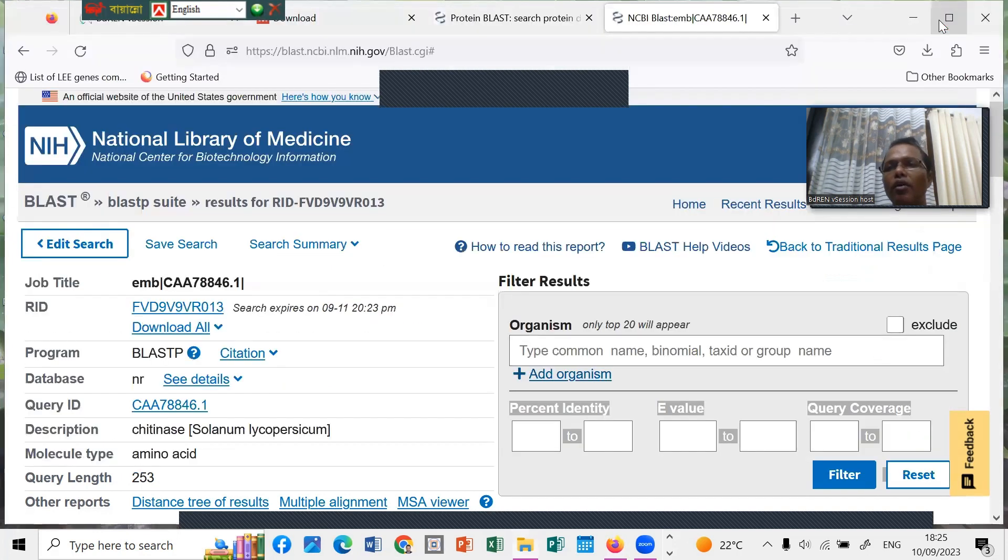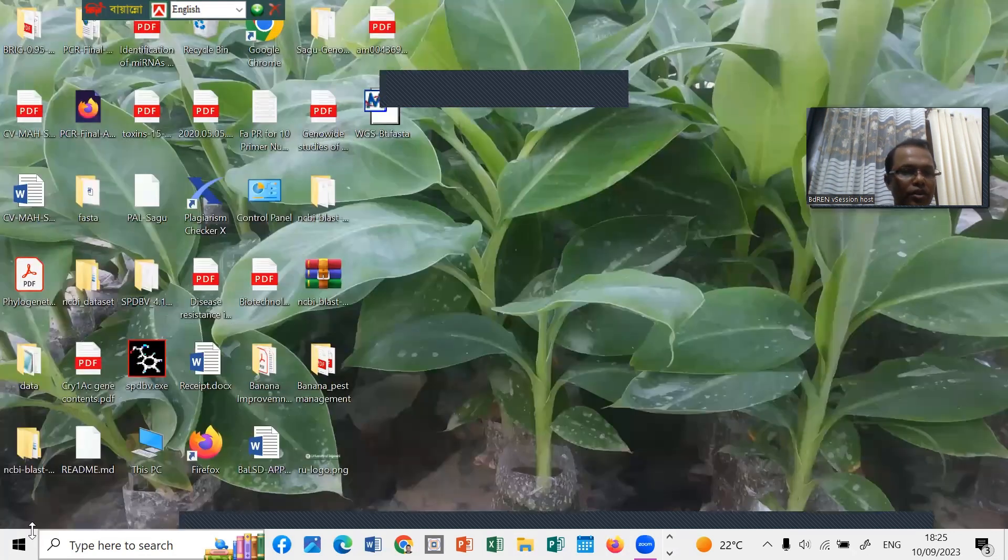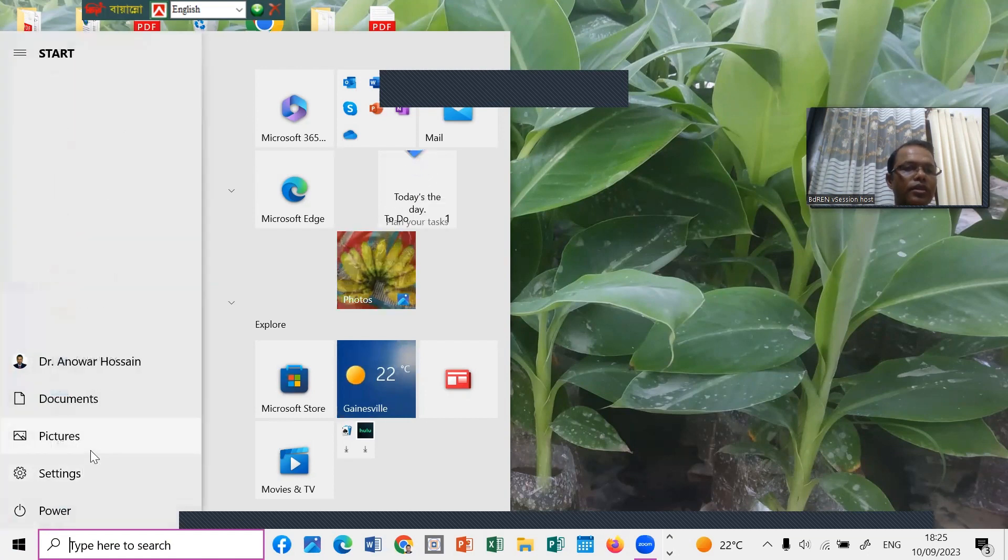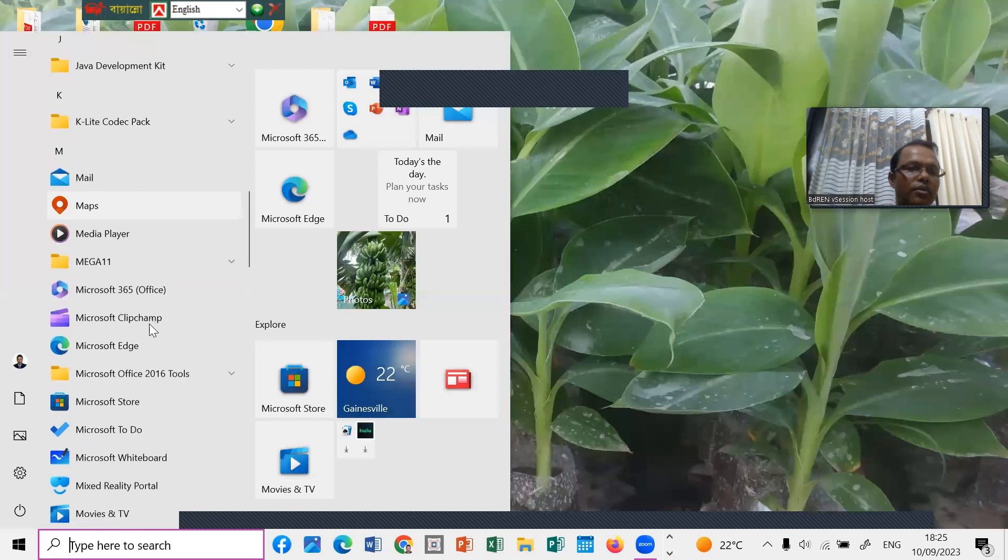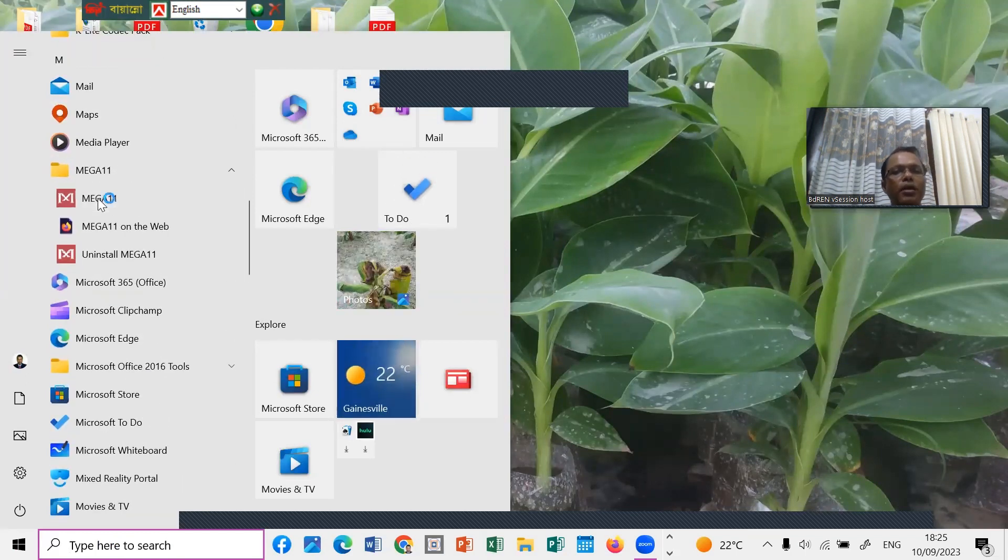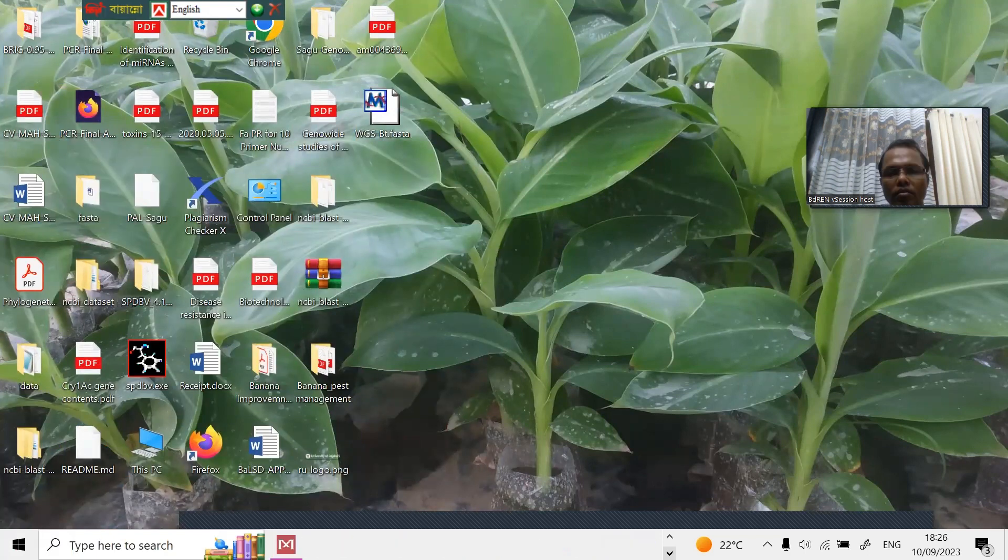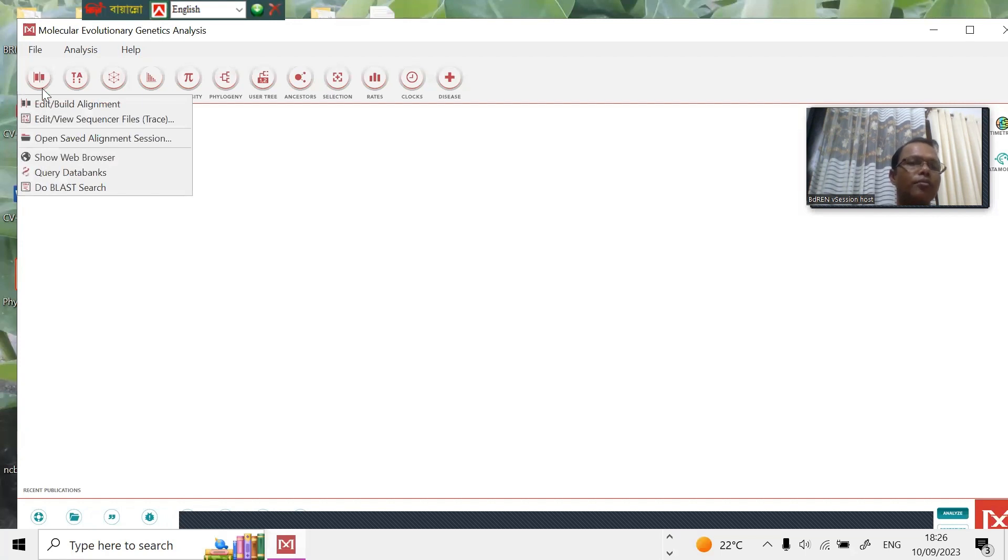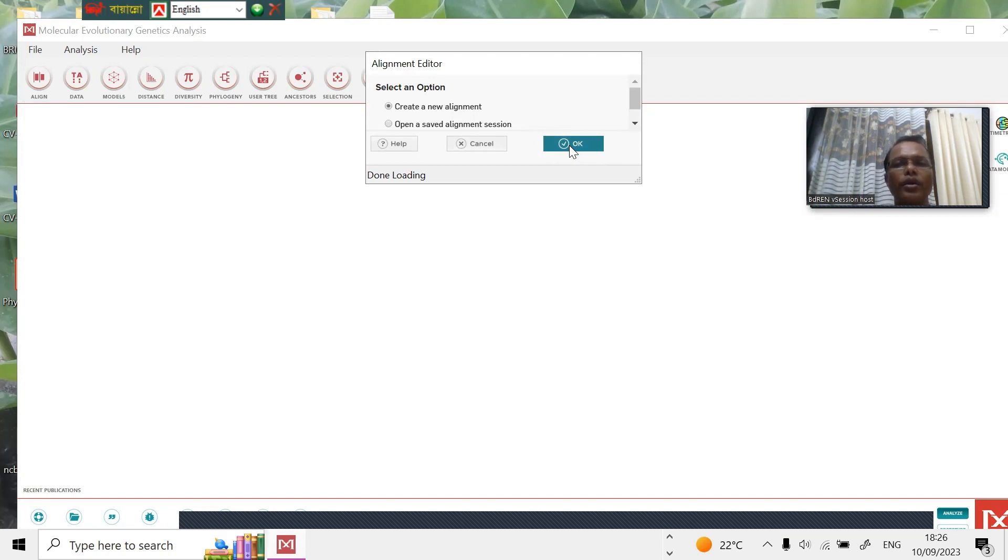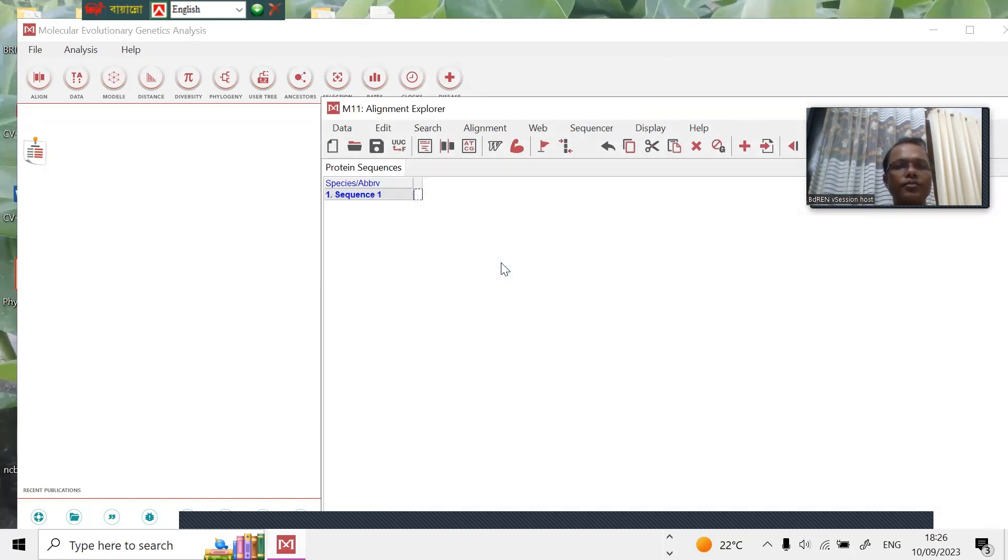Just start from the start button. You can see MEGA 11 is here. Click MEGA, so MEGA is already open. At first we have to click 'Align', build, edit or align, create alignment, then click the protein sequence.